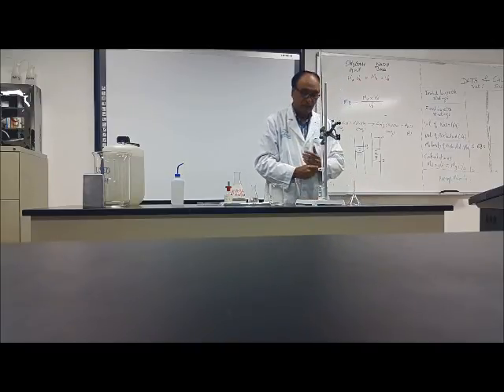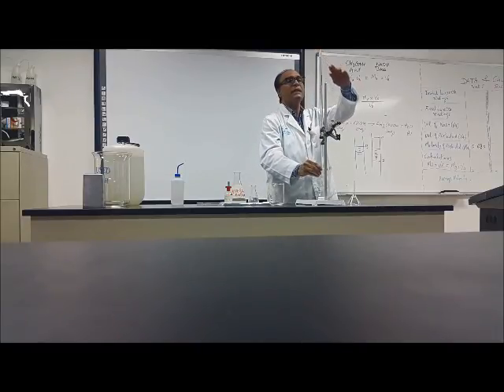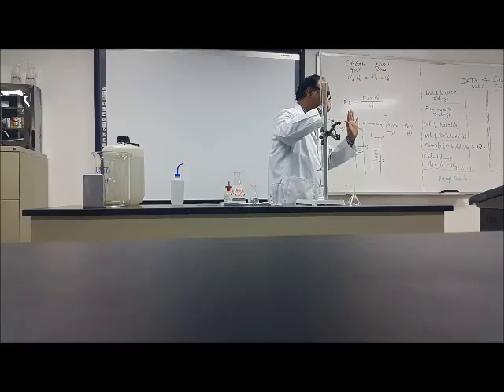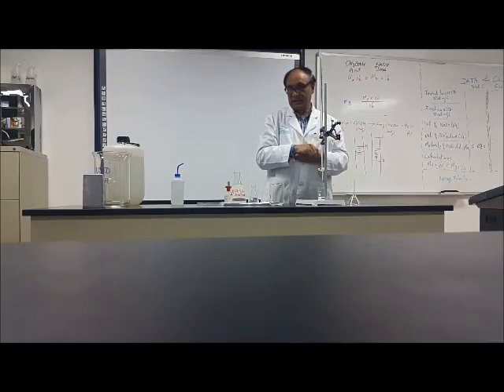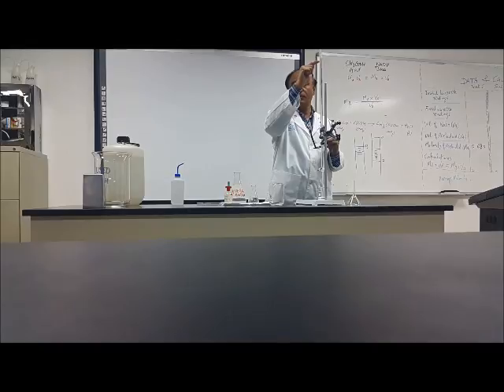I will open it first, move it down, and bring it down to any point. Here, here, here, any point. And then you will record this one. There is a graduation number.